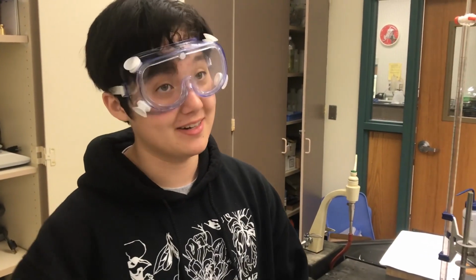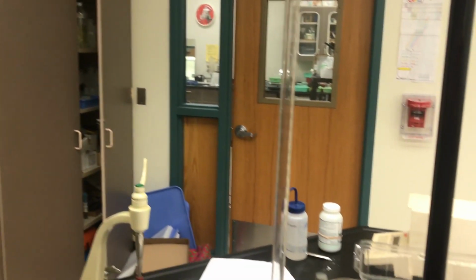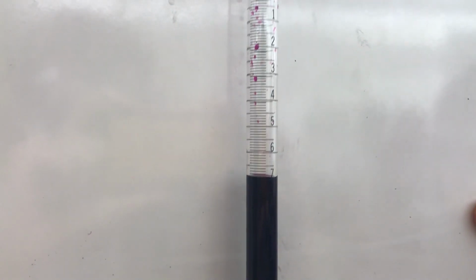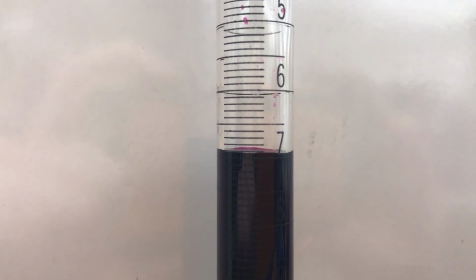Now we're going to standardize the solution by titrating the FAS with the permanganate. But before we do that, we have to read the volume of the burette. In order to read the burette, you read it from the top down, and you look at the bottom of the meniscus. So we're going from 6 down, so it looks like that's about 6.95.